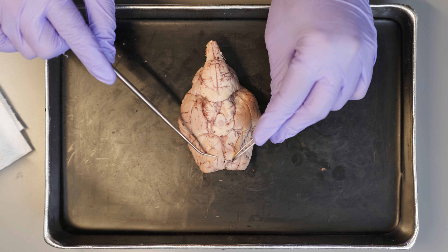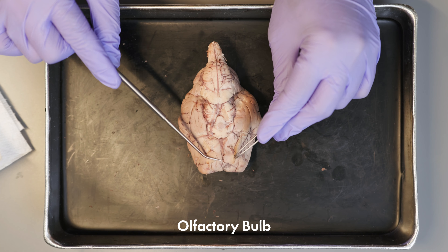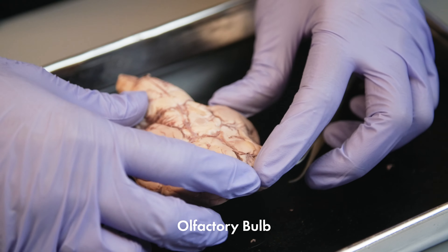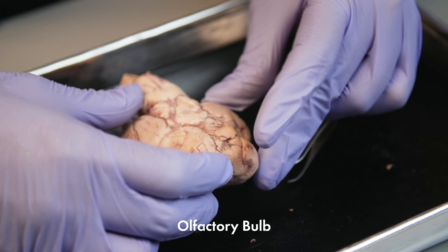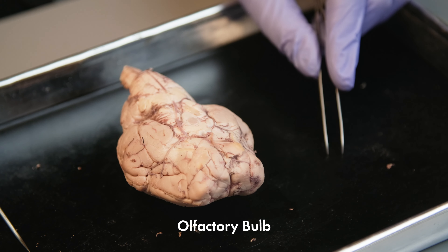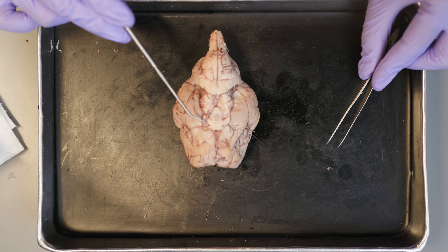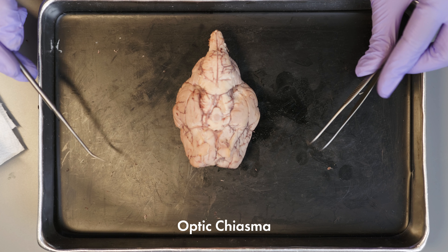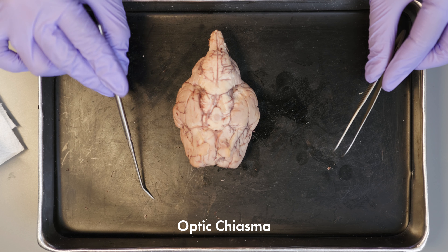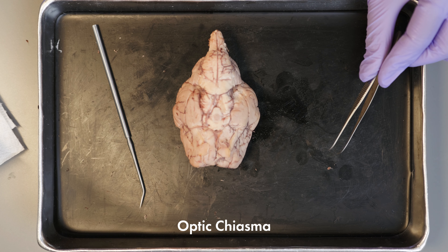Even though we cannot see those nerves anymore, we can see the olfactory bulb. The olfactory bulb lies below the frontal lobe of the cerebrum and is where all the cell bodies that connect with the olfactory nerves are — which are the first cranial nerves. This X-shaped structure is called the optic chiasma. It is formed by the crossover of the right and the left optic nerves. The portion of the optic nerves has already been removed, but we can still see the optic chiasma.